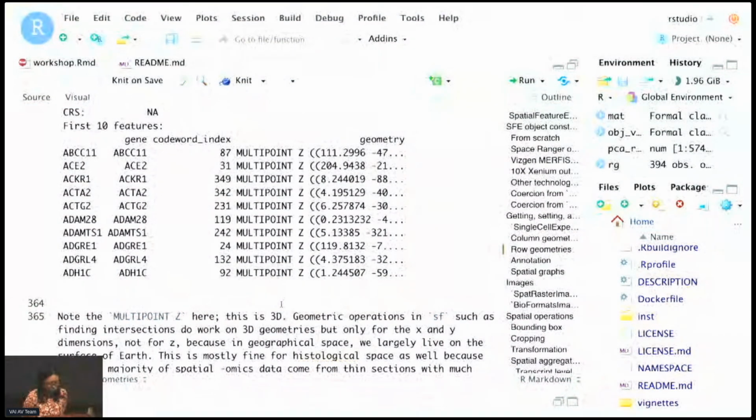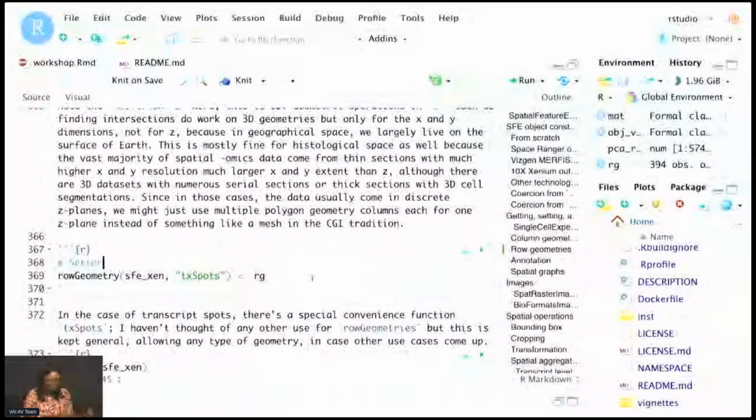But also, for now at least, in histological space it's fine because the vast majority of data is in thin sections, so mostly X and Y. But I know that there are some datasets that have a 3D volume, like a thick section, 100 micron, and there are also some with multiple Z slices, especially in the mouse brain. Those aren't many, but if they become more common, then we do have a plan to expand SFE to accommodate those.